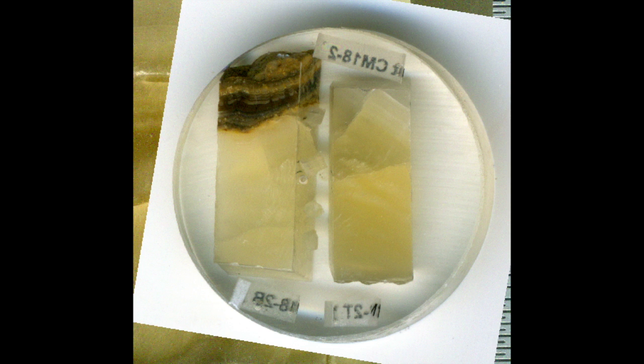So to show you the power of the SIMS, this is a white light image of our sample chip, and these tiny black dots are where the SIMS is measuring oxygen 18. So each one of these tiny circles is about 10 microns in width, and it represents one of the oxygen isotope measurements that I make on the SIMS. So you can see how fine of a scale I'm able to measure oxygen isotopes in this sample.